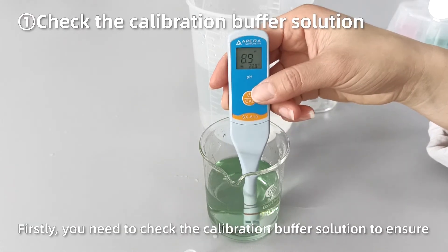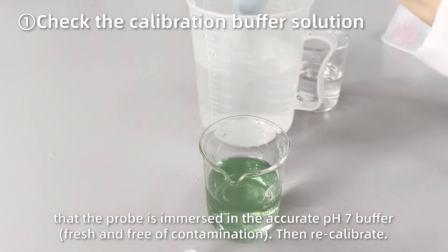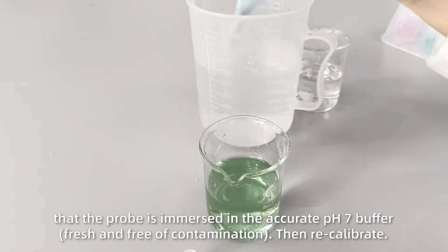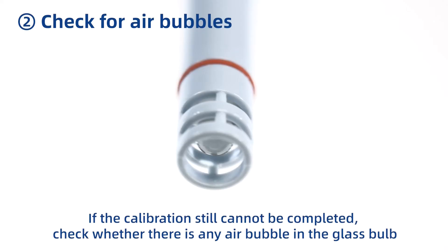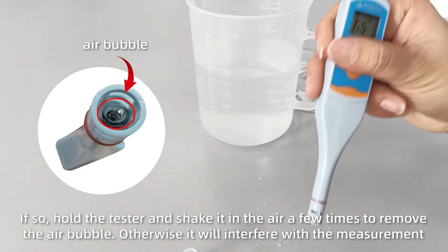Firstly, check the calibration buffer solution to ensure that the probe is immersed in the accurate PH7 buffer, then recalibrate. If the calibration still cannot be completed, check whether there is any air bubble in the glass bulb. If so, hold the tester and shake it in the air a few times to remove the air bubble.